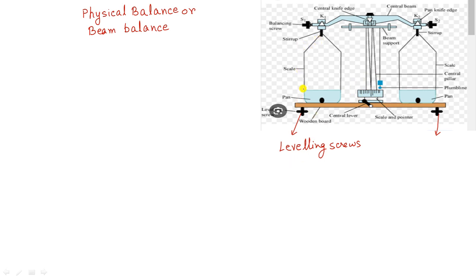The next part is the pan. The function of the pan is that we put the weight box and the object whose mass we want to measure in the pan. We put a weight on one pan and the object on the other pan to measure the mass of the object.